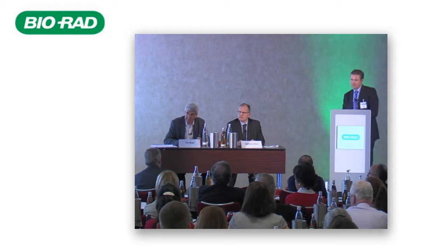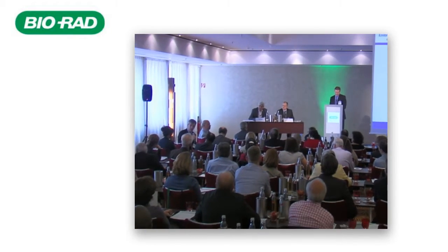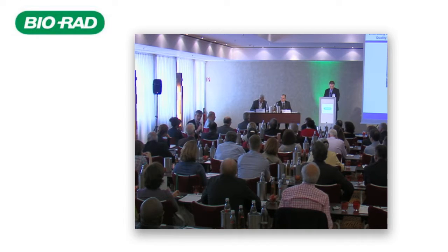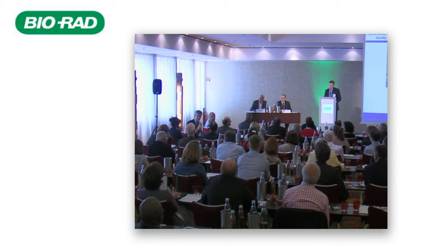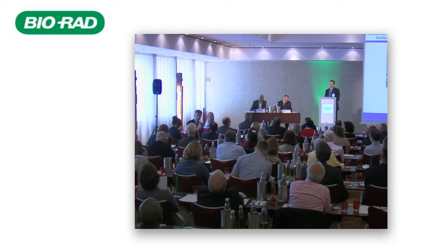Dr. Jones. Perhaps if I could just address that question from the Australian perspective, we have now over some years, starting with a government initiative, been asked to try and identify poorly performing laboratories. The initial process was to set up a global ranking based on all of the participation, review those in the bottom 5% by an expert review and look for typical failures like just transposing some data, and then see if those at the bottom may be considered poor enough to submit to the regulatory body. At the moment, as of last week, we send that report out to all laboratories so they can see where they are in a global ranking. The openness was part of the policy. We will not be passing it on to the accreditation bodies due to legal issues, but we feel that the first thing we're doing is letting laboratories know that overall they're right at the bottom, and should really be looking at what they're doing.